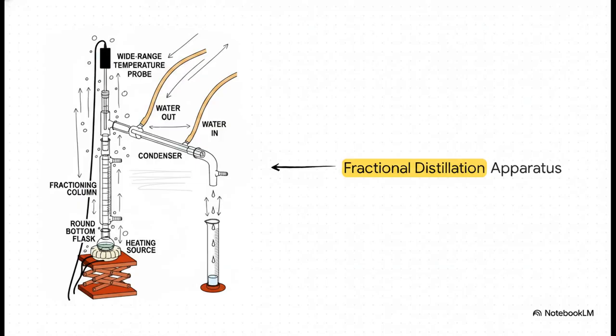In this kind of setup, sitting vertically between the heating flask and the condenser, you have the fractionating column. It's essentially a long glass tube packed with materials, like little glass or ceramic beads. And these beads, they are the real MVPs here, providing the physical surface area needed for those theoretical plates to actually happen. The vapor climbs, hits a bead, condenses, heats back up, vaporizes again, and climbs even higher. This setup allows multiple simple distillations to happen in just a single pass, and that is exactly how we separate miscible liquids with super similar boiling points, like ethyl acetate and butyl acetate.